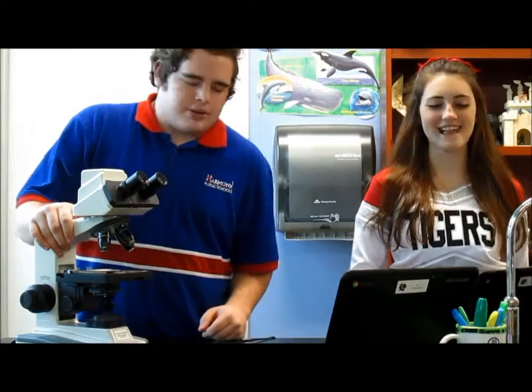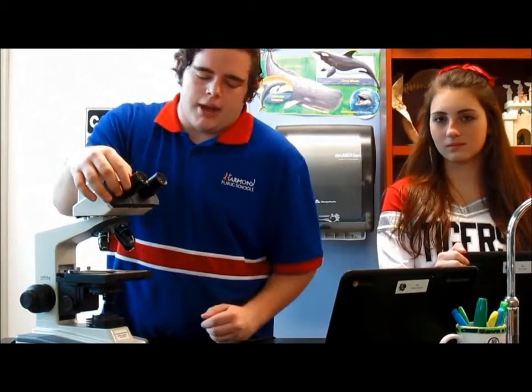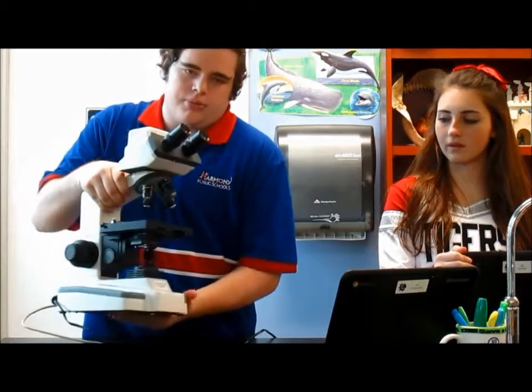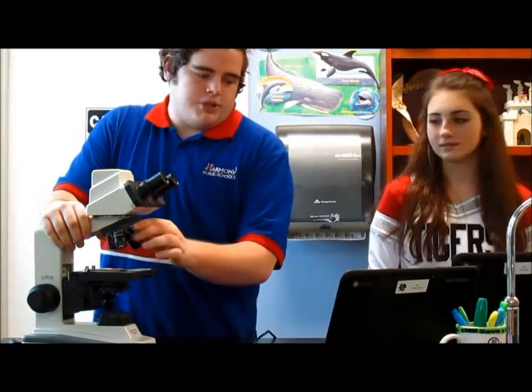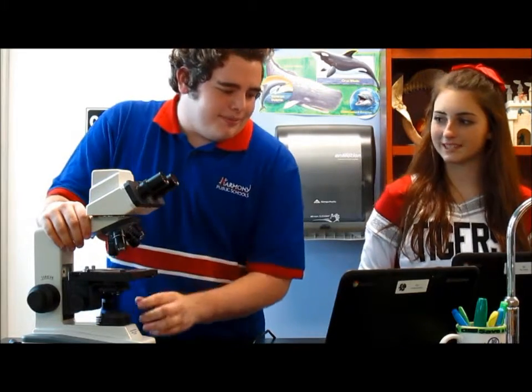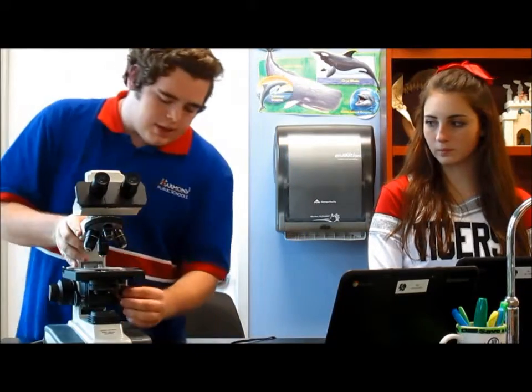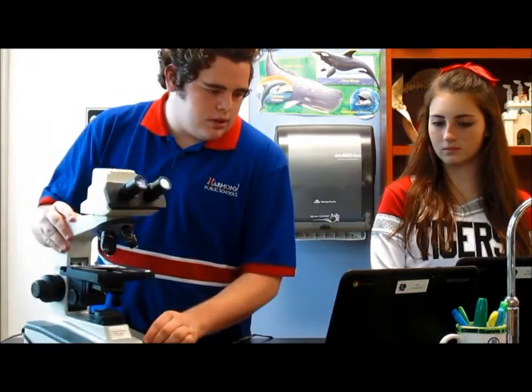So now I'm going to name all the parts on the microscope. Right here are the eyepieces. This is the arm that you pick it up from, and you put your hand under the bottom whenever you pick it up. These are the objective lenses. There's different sizes. The stage controls are on the side. You make it go front, back, and side to side.